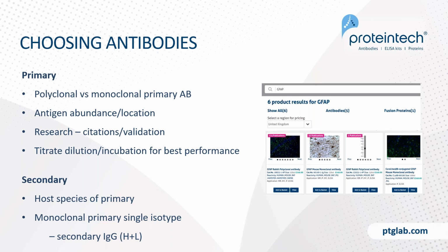When choosing your secondary antibody, you want to make sure that it is against the host species of your primary. And if you're using a primary monoclonal antibody, then you have to ensure that your secondary has IgG heavy and light chain specificity in order that it will recognize the isotype of your monoclonal.